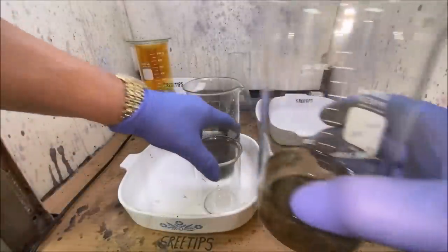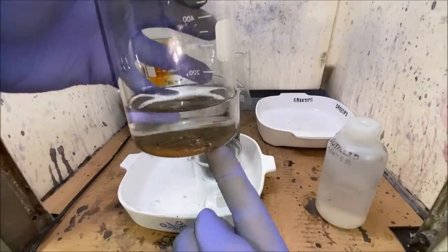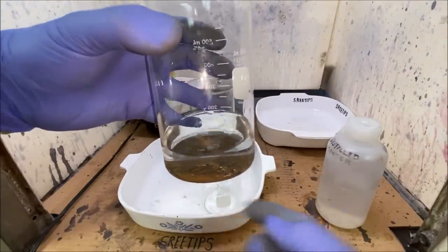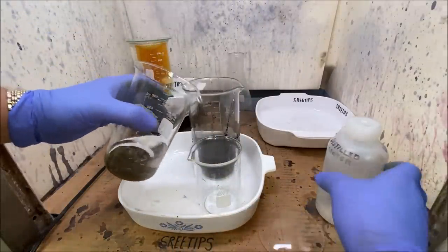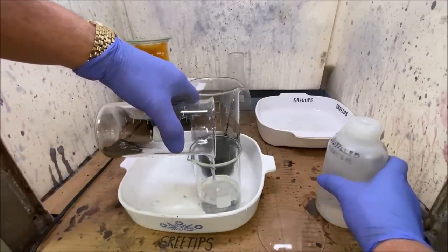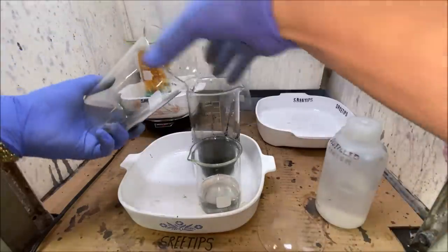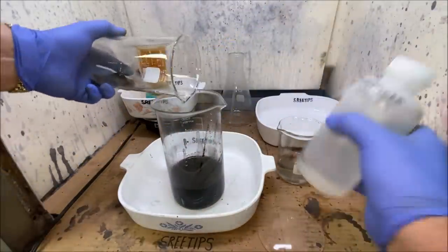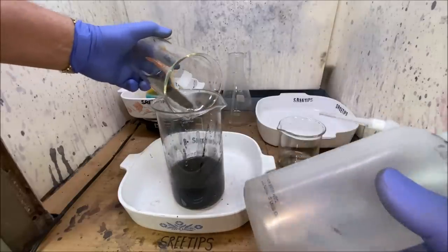All right, here's the solids that we pulled from our part one, that big beaker. I put those in a separate beaker and saved those. I'm just gonna pour this liquid off now. And then we're gonna add these solids right into this beaker that we're getting ready to hit with Piranha solution. This is gonna be a lot of gold in here.